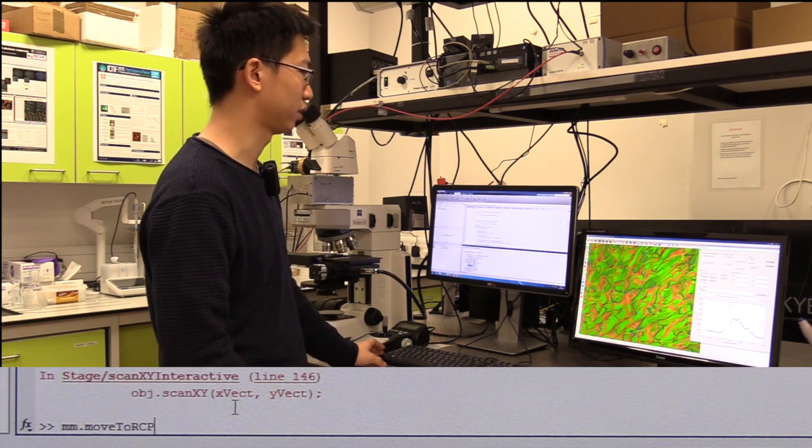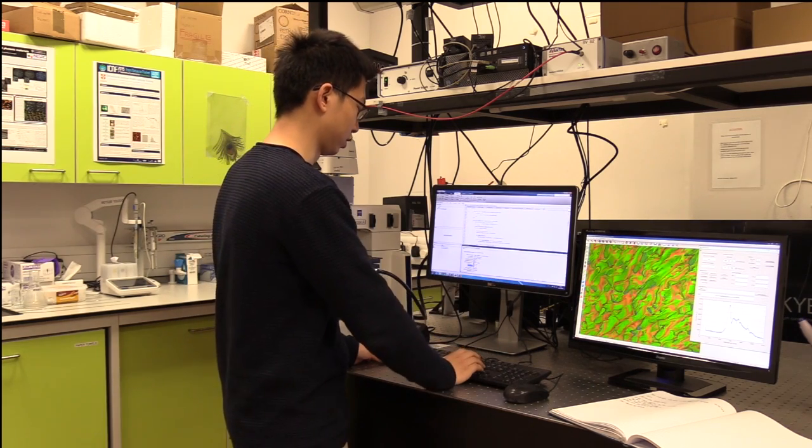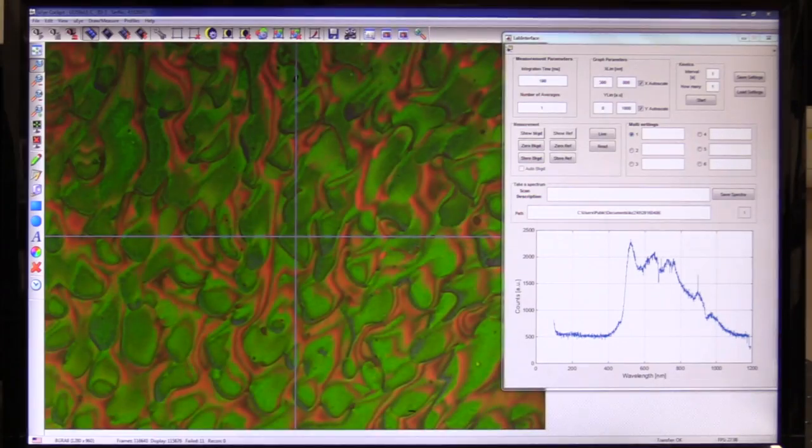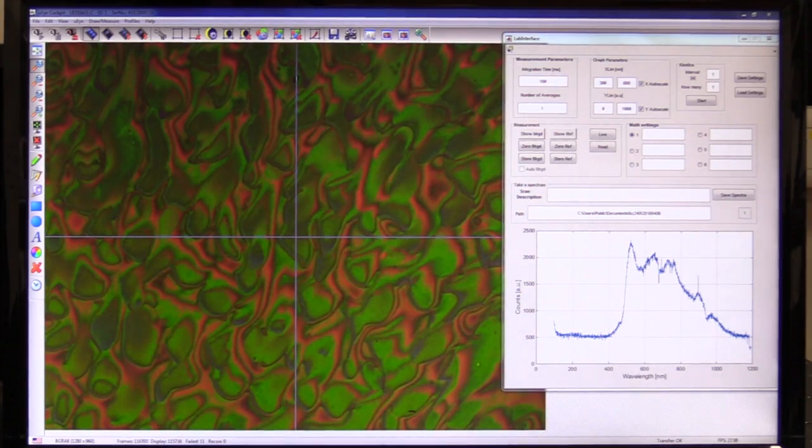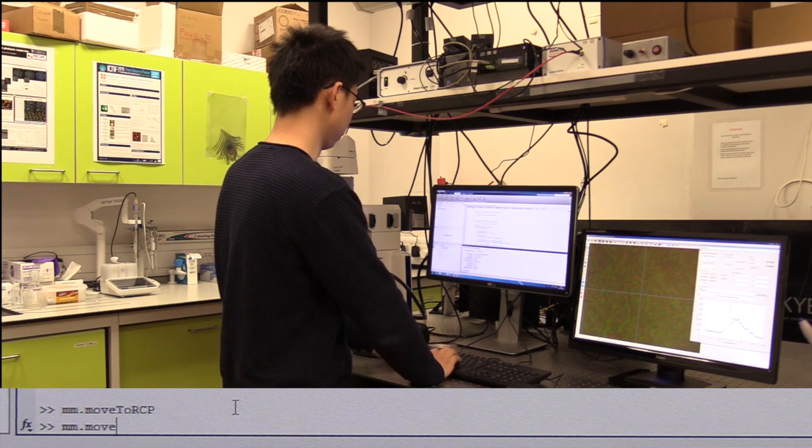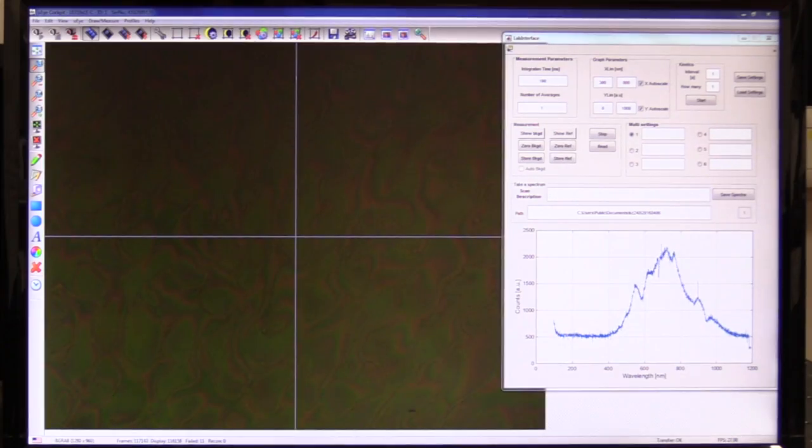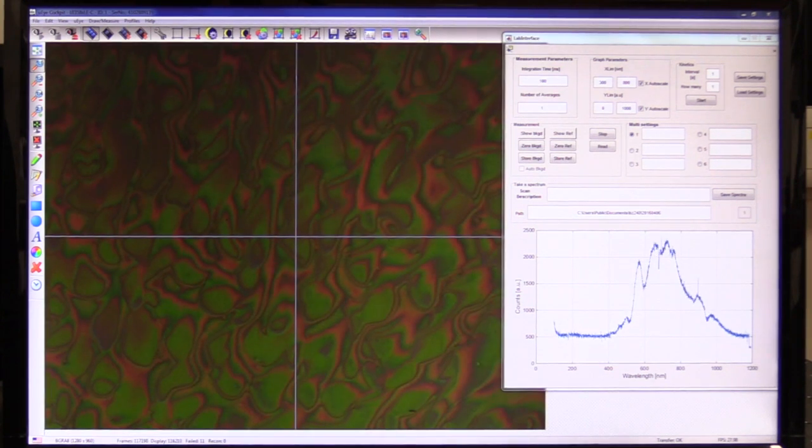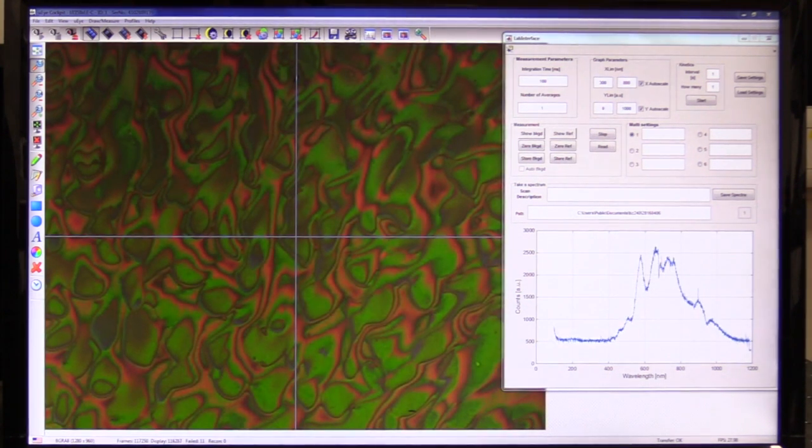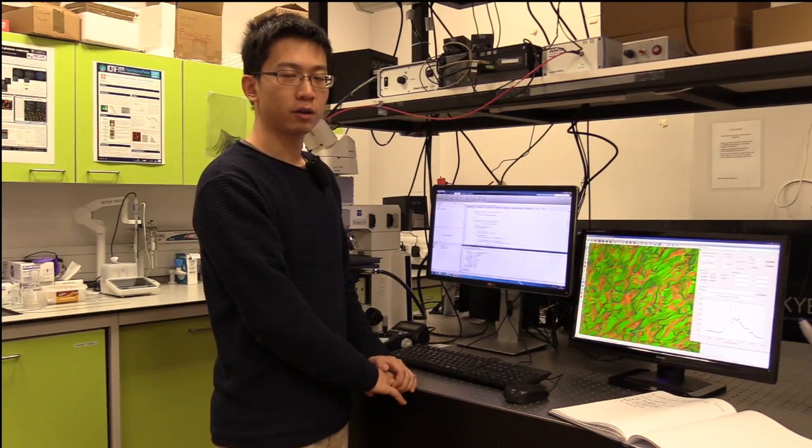Now I will show you how to move it to the right-hand circular polarization channel, and you will see the color on the screen fades out. Now to go back, I type in move to LCP and you can see the color comes back.